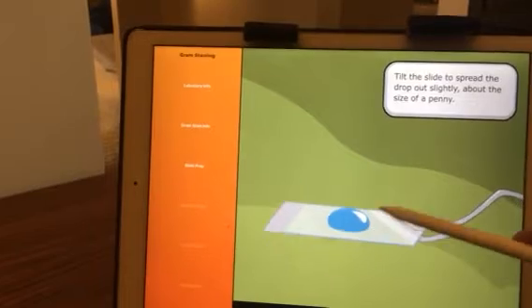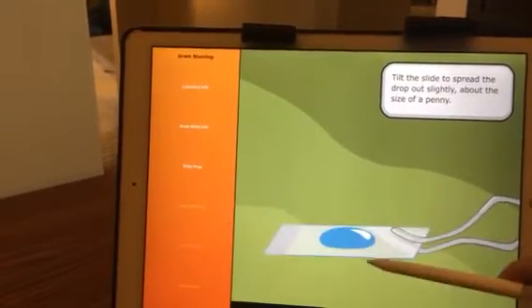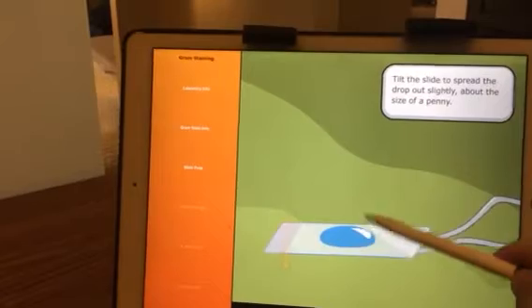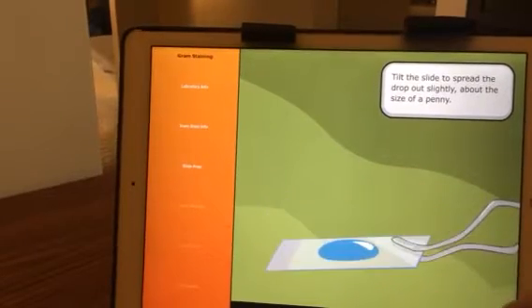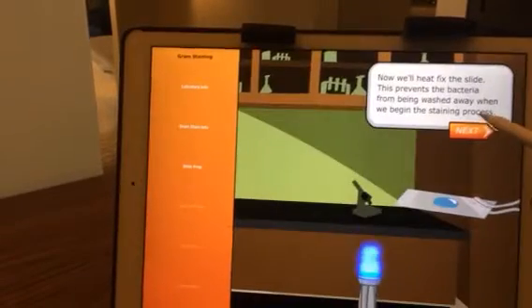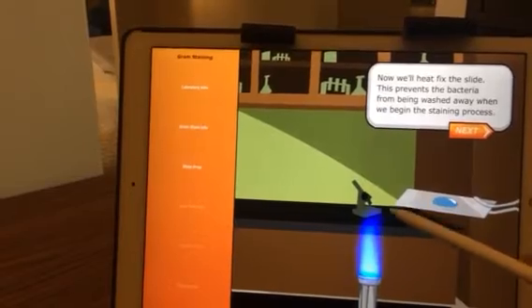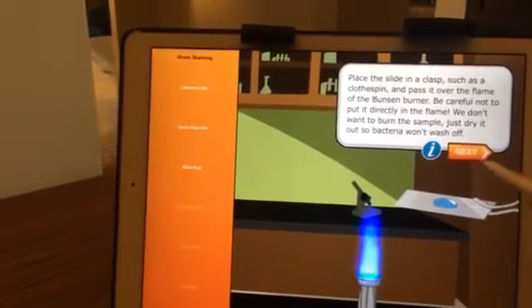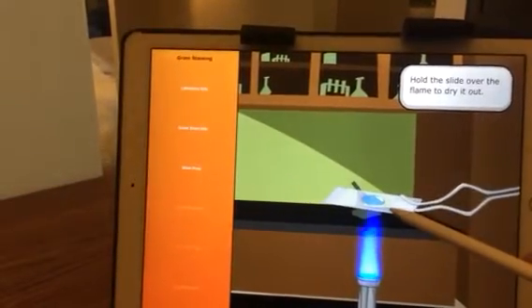Tilt the slide to spread the drop out slightly, about the size of a penny. Now we'll heat fix the slide. Place the slide in a clamp and hold the slide over the flame to dry it out.